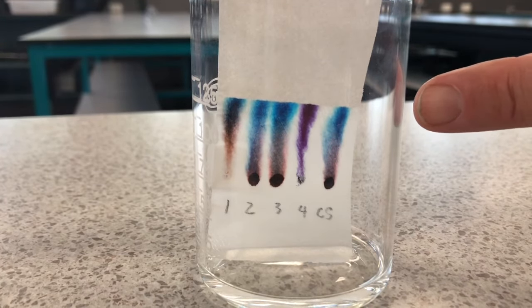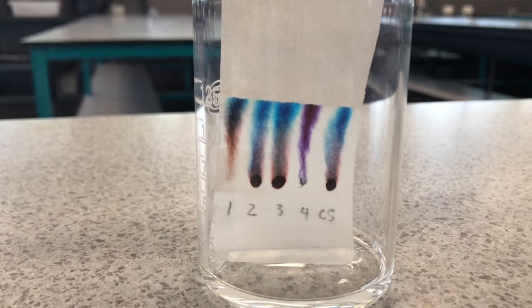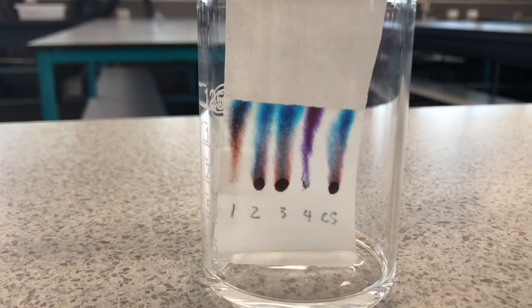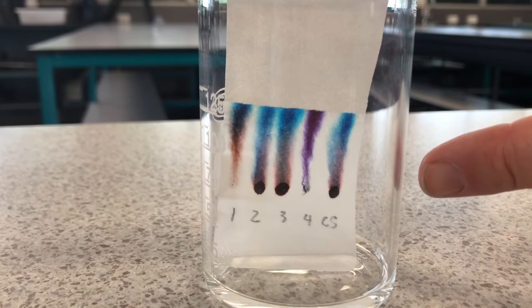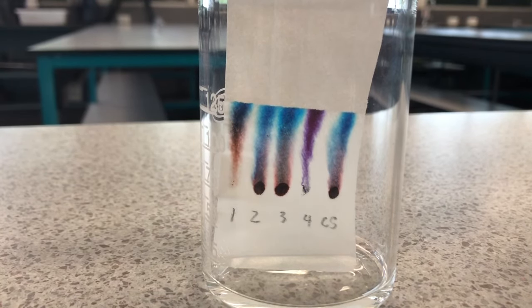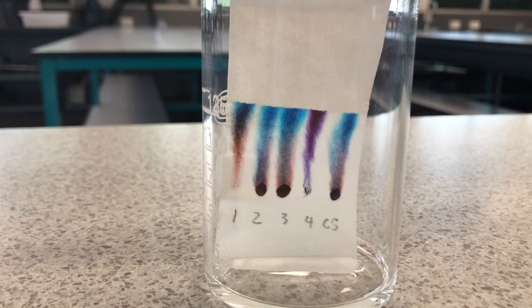Even though these pens look black, they're not actually black at all - they're made up of a number of different colors. The pattern we see depends on how soluble each of those different pigments are: the more soluble, the further up they go; the less soluble, the earlier they get deposited. That's a characteristic color pattern for a particular pen, so scientists can use this to pinpoint the pen used at the crime scene. This technique is called chromatography.